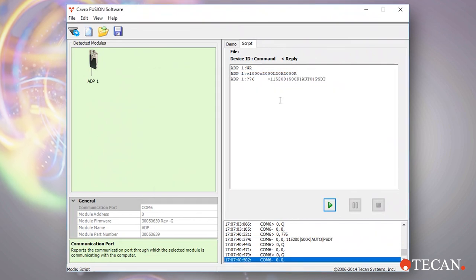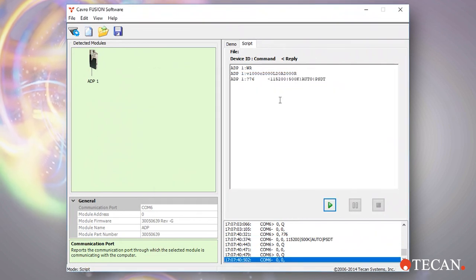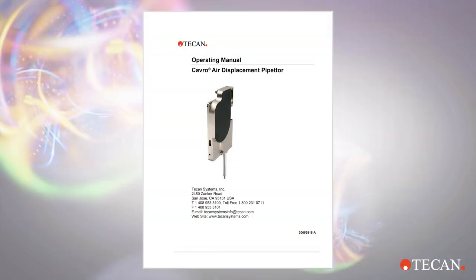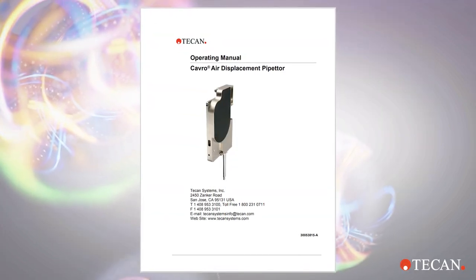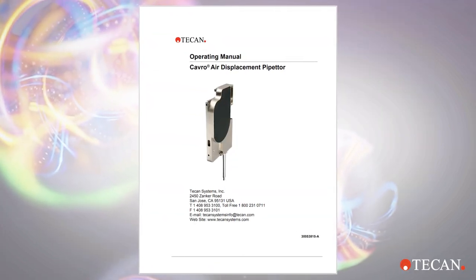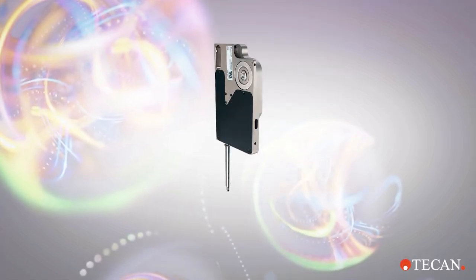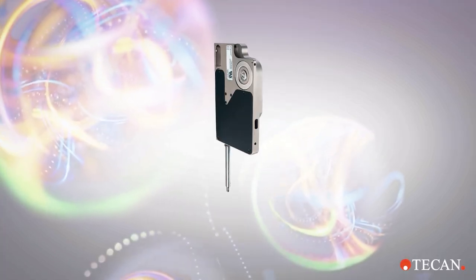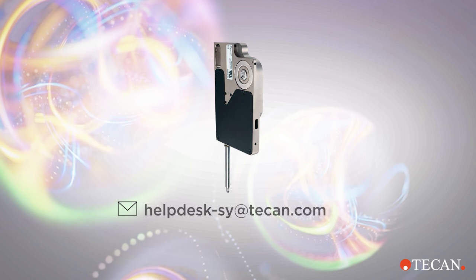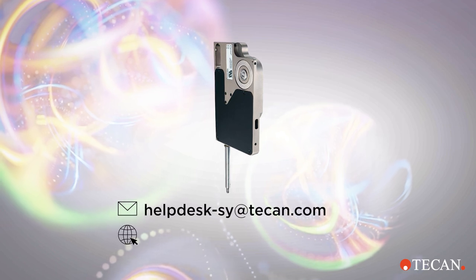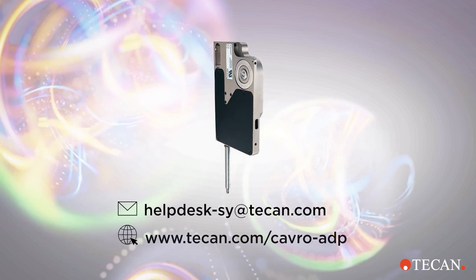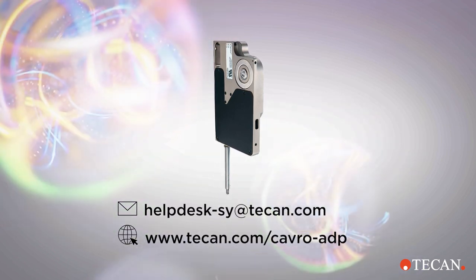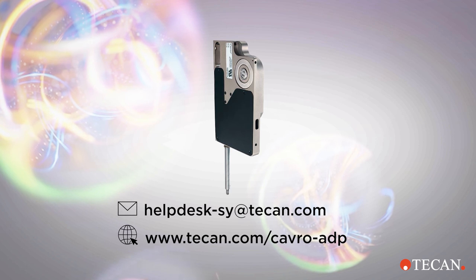Of course, getting the ADP initialized and communicating is only the first step in your use of the ADP. Refer to the ADP manual for the full range of pipetting and other commands. I hope this short introduction video has been helpful. If you have any questions getting started or with any other usage issues, please contact TECAN's technical support line. We are here for you.